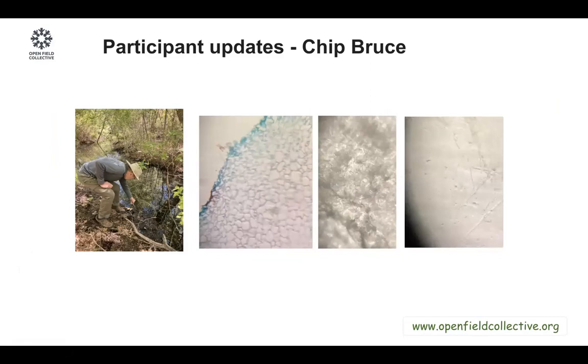So the alignment and all, I think, looks great. We can clearly see the cells on the left image, and I think, Chip, can you just explain to us what the images on the right are? Yeah, sorry. I think the second one was onion skin. I mean, not onion, garlic. From a garlic clove, I just got some of the thin skin around it.